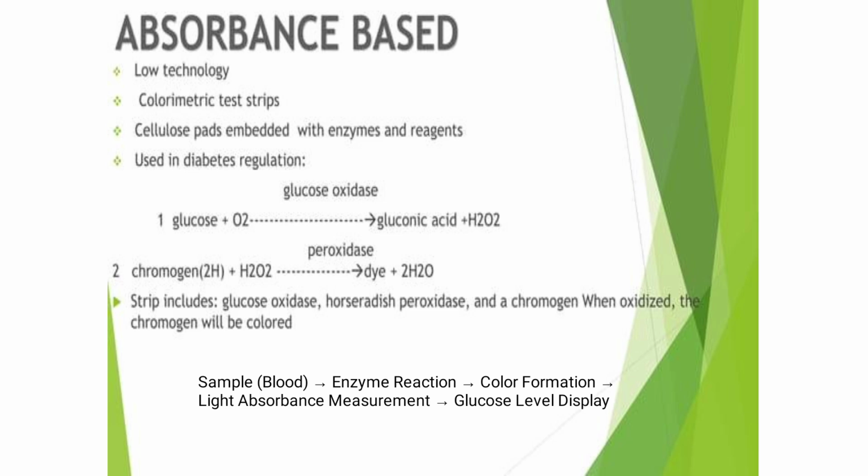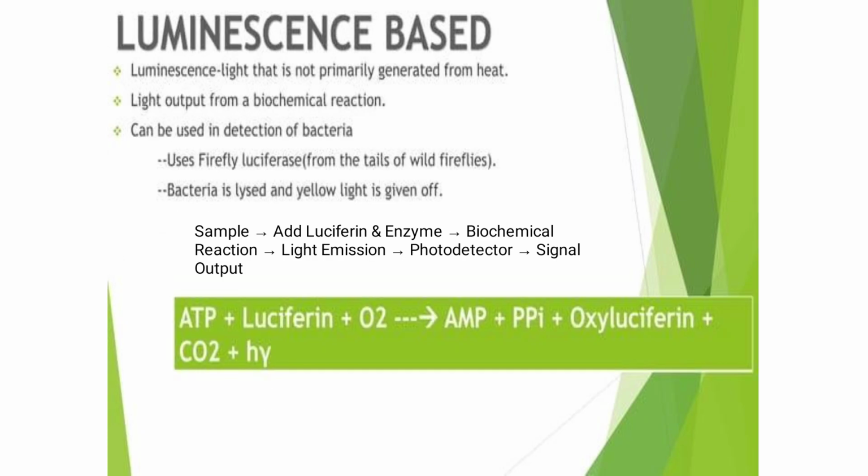And in the extrinsic fiber sensor, the input fiber channels light away from the source and delivers it to the external region where the actual reaction is taking place. Depending on the specific clinical target, this external modulation may be constructed and it will be given to the chemical mechanisms. Next are the absorption based optical sensors and the luminescence based optical sensors.